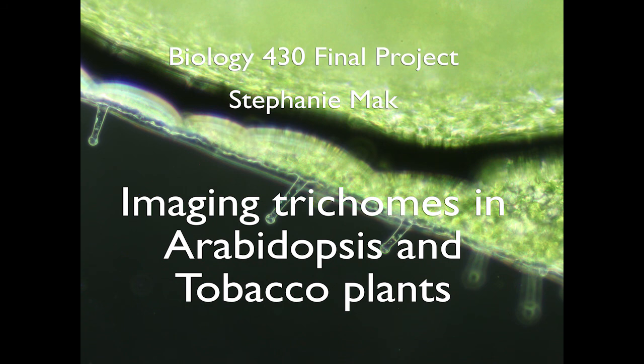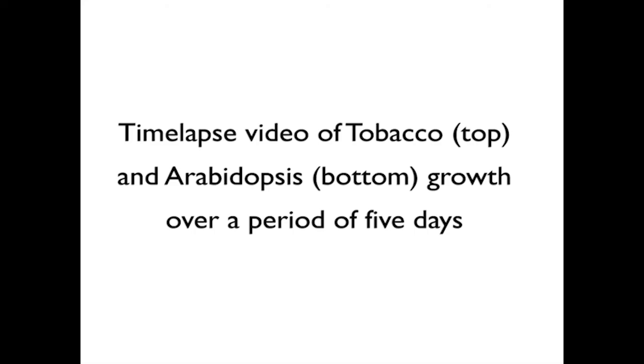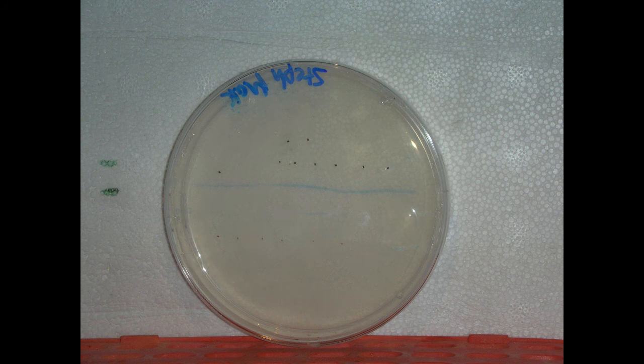Howdy everyone! My final project involved growing and studying trichomes in both arabidopsis and tobacco plants. To begin this project, I did a time-lapse video of tobacco on the top and arabidopsis on the bottom and their growth over a period of 5 days.